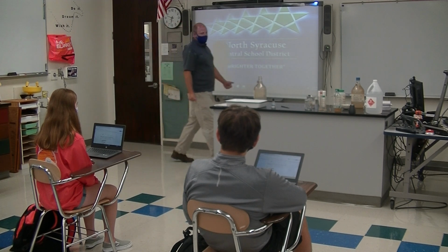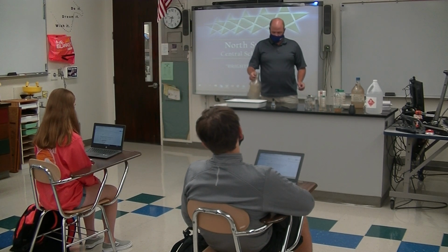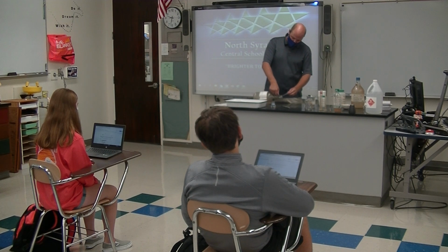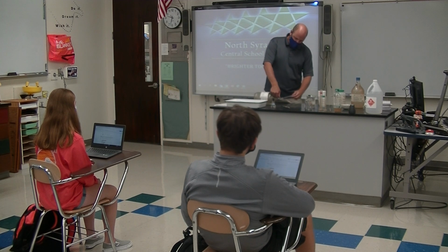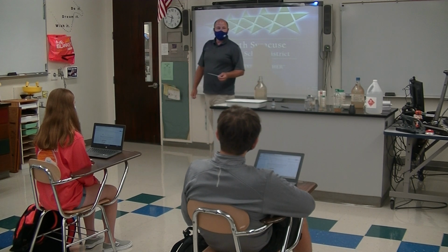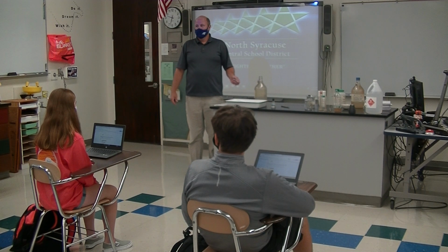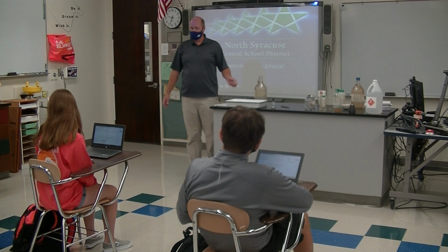Now, what do you think you'd do if you were to get an acid on you? Hopefully it's not this strong of an acid, but if you were to get an acid on you, suggestions? Anybody awake? It's not that late in the day yet. What do you do if you get an acid on you? Rinse it off. Where do you rinse it off? If you're in here, where do you rinse it off? The sink. There's sinks all around the room. I think there's 9 of them. And you're never going to be too far from them.